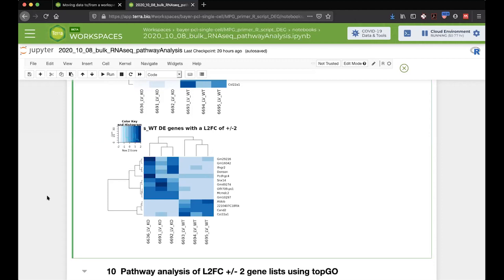Amelia, there was one question just about the difference between normalized counts and TPM or RPKM. Sure. The way that I've always thought about it, and I don't know if this is entirely correct, is that I've always thought about normalized counts as necessarily being TPM, RPM, FPKM. Because at that point, you have to be looking at transcripts per, in this case, this is Kallisto, so this is transcripts per million. As soon as you invoke weighting functions to say, okay, there's a difference in total sequencing depth between sample 1 and sample 2, and we need to align them so we can compare them.